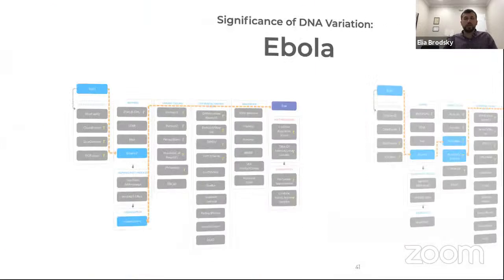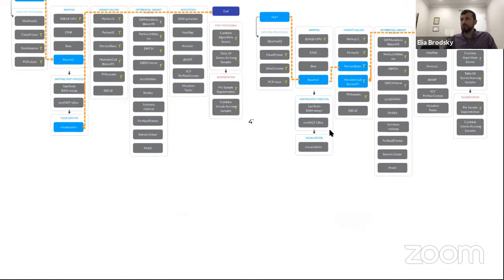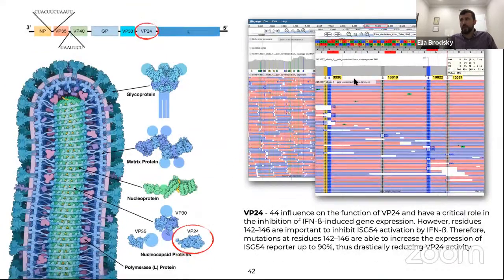Here we have the Ebola virus. So we can ask 2 different questions from this data. One question is, let's visualize this data, okay? So if we visualize the data, we are expecting to see something that looks like this. And here we will find specific mutations, specific positions in multiple samples that all agree that there's a change from the reference genome.